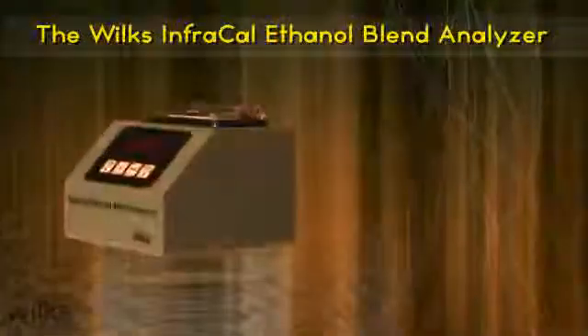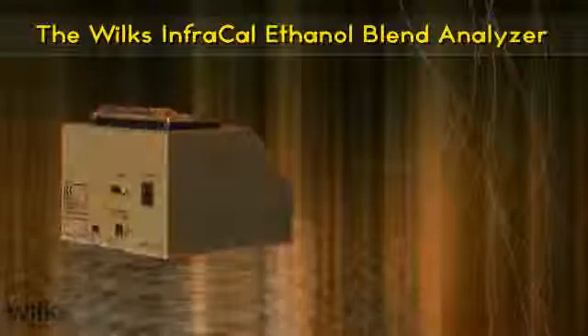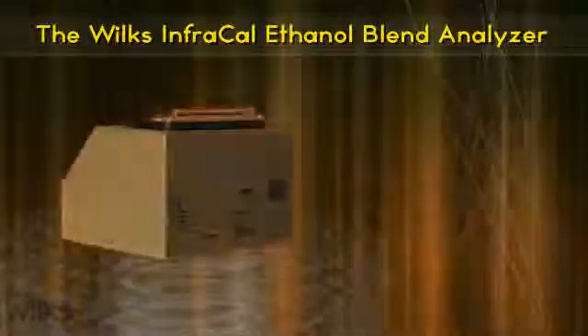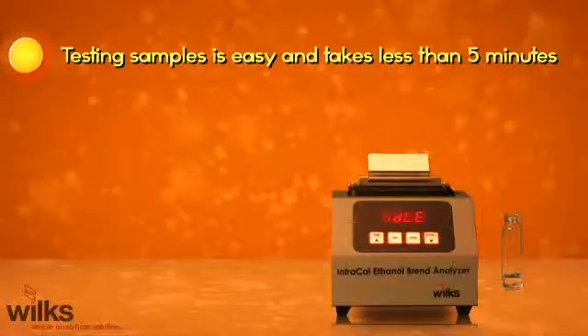The Wilkes InfraCal Ethanol Blend Analyzer helps fuel blenders quickly flag out-of-spec product and ensure the final blend is correct. Testing of fuel samples takes less than five minutes and requires only a few simple steps.